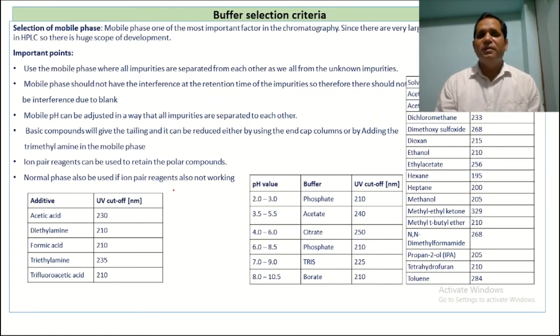So buffer selection is very important. We have to choose the buffer carefully during analytical method development, based upon the compounds and the UV maxima of the method.